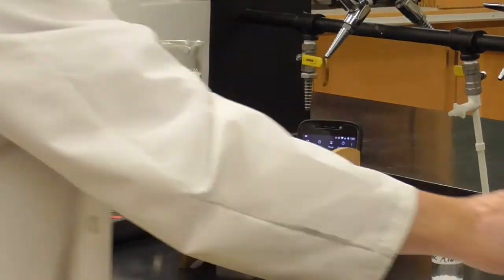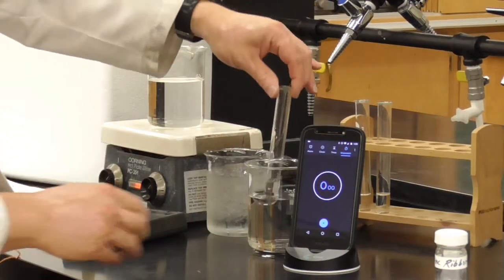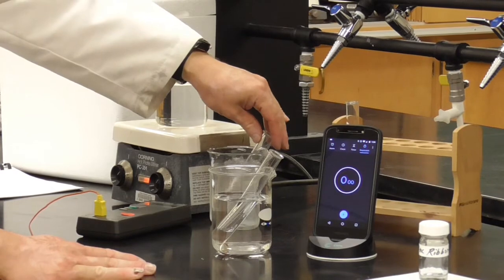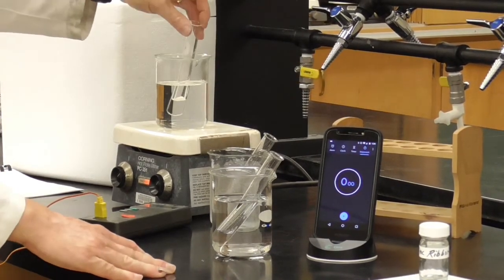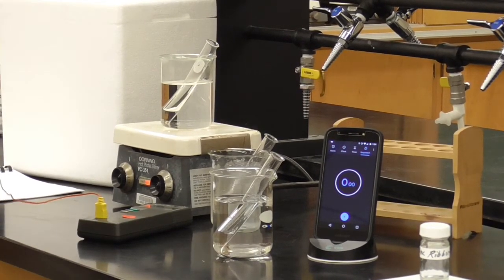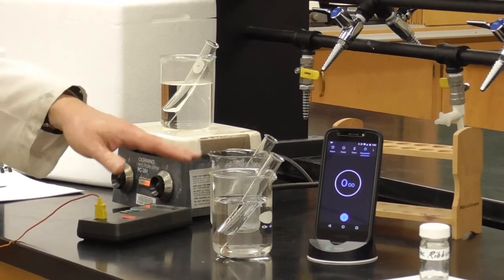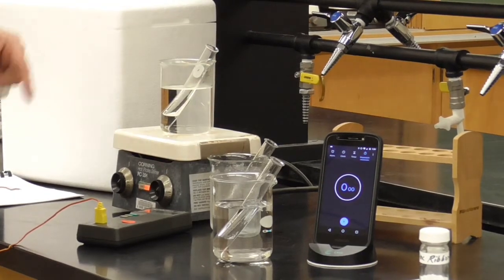One of them we'll go ahead and put in the room temperature water bath, like that. The second one, we'll go ahead and put that here in the ice water bath, so it's going to start to cool off. And the third one, we'll put it up here in the hot water bath. And then we'll get the reaction going. Now this is already probably at room temperature, so I don't need to worry about letting it come to temperature. The other two, while we observe this one will be cooling off inside the test tube. This one will be warming up inside the test tube.